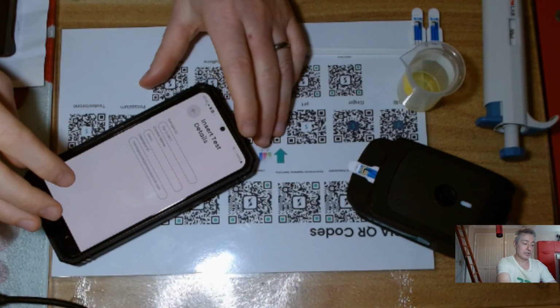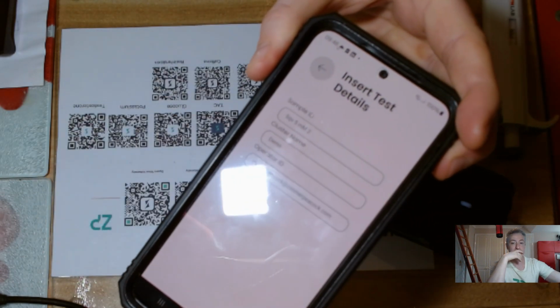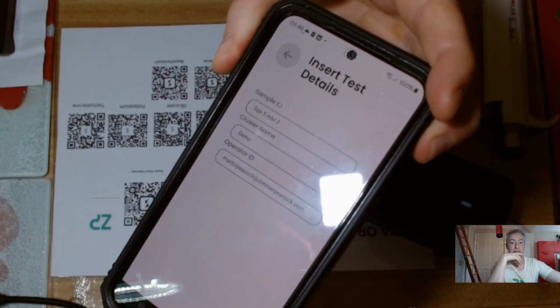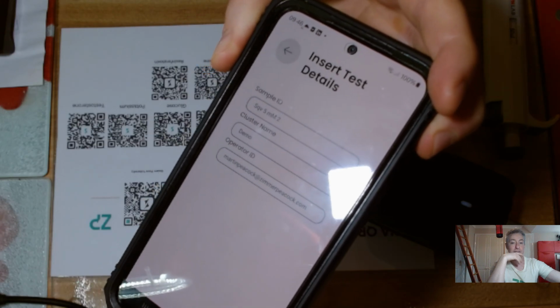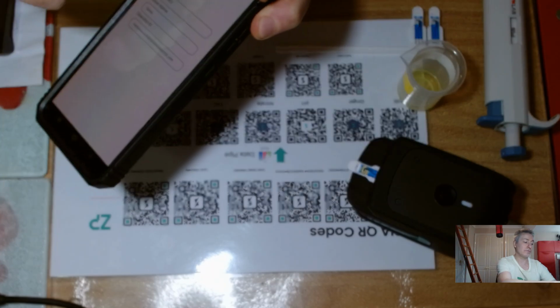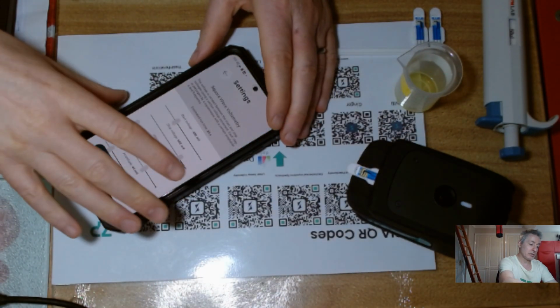Next thing I'm going to do is give this file a name. So I've called it Square Wave Voltammetry 5 millimolar because that's the ferricyanide solution I'm using, and I've called it number 2 so I can find it, and I've put sample cluster as a demo because that will allow me to find the data easier later on. Now I'm just going to go continue.